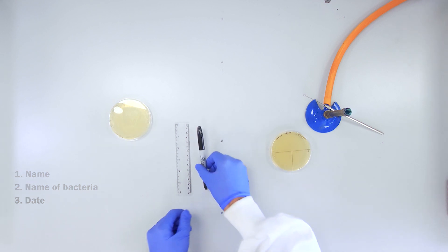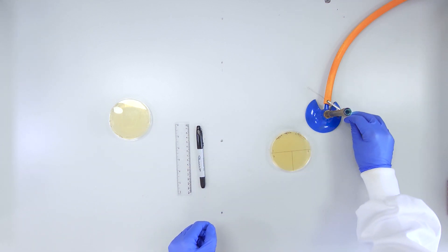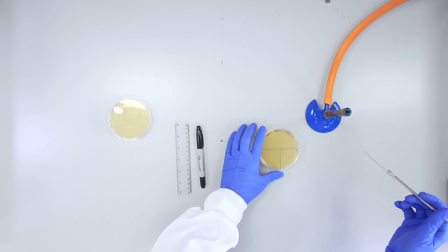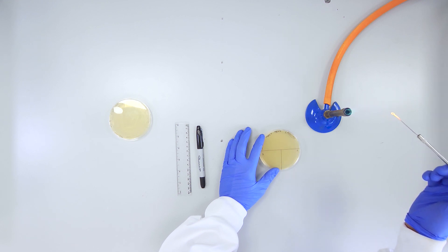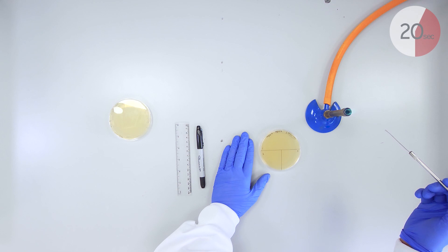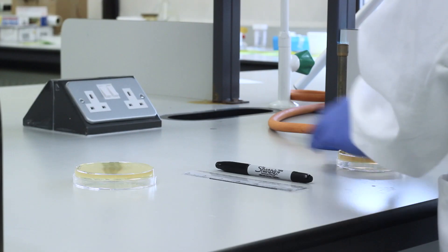Before beginning, you must sterilize your inoculating loop using the Bunsen burner. Place the loop into the middle of the flame until it is red hot. Remove from the flame and allow to cool for 20 seconds in order to avoid killing the bacteria that you will pick up using this loop.